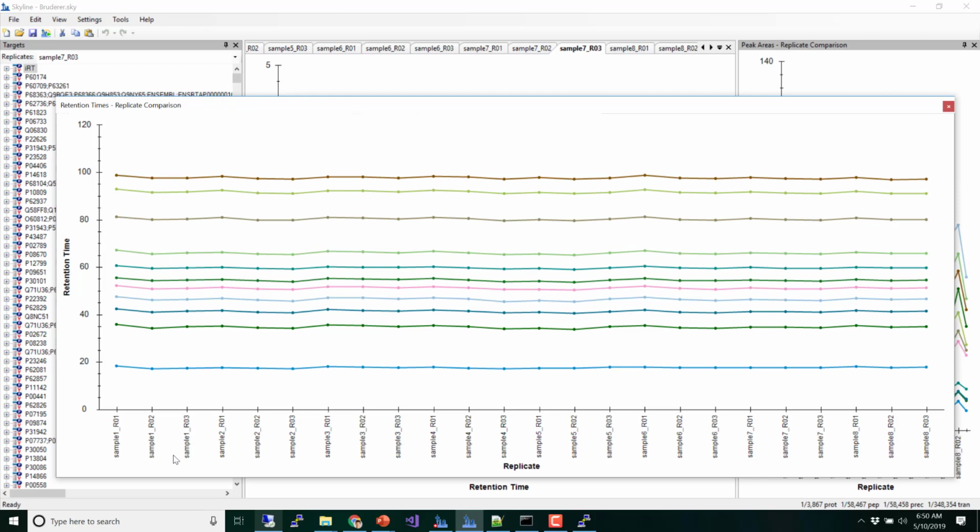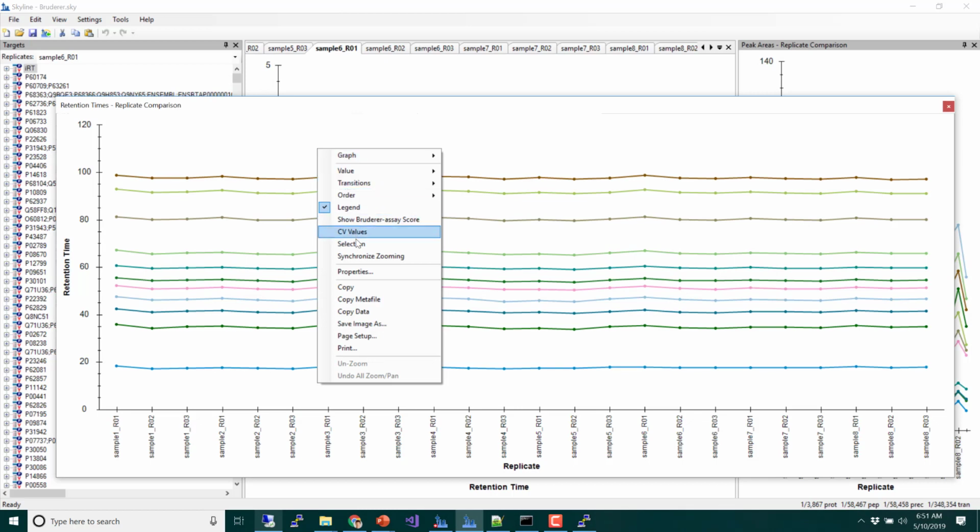Yes. Do you have that? Or what? One peptide missing? Oh, no, the line. Okay, that's not missing. Okay, so that's just you. What? Okay, so there should not be anything missing in this one. Here. So I must have turned off selection.